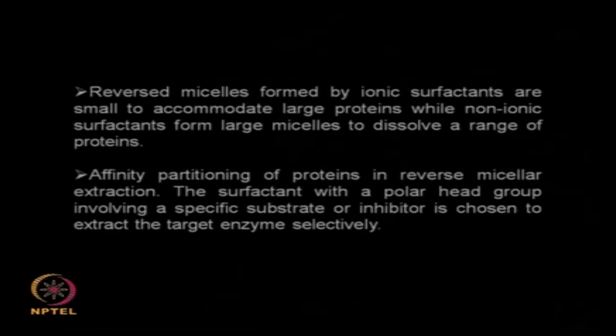This is a very intelligent way of improving the selectivity of the protein which you are extracting. If I have certain inhibitors attached to the polar head groups, then the enzymes or proteins may be selectively captured inside the inner core. That is called affinity partitioning in reverse micellar extraction.